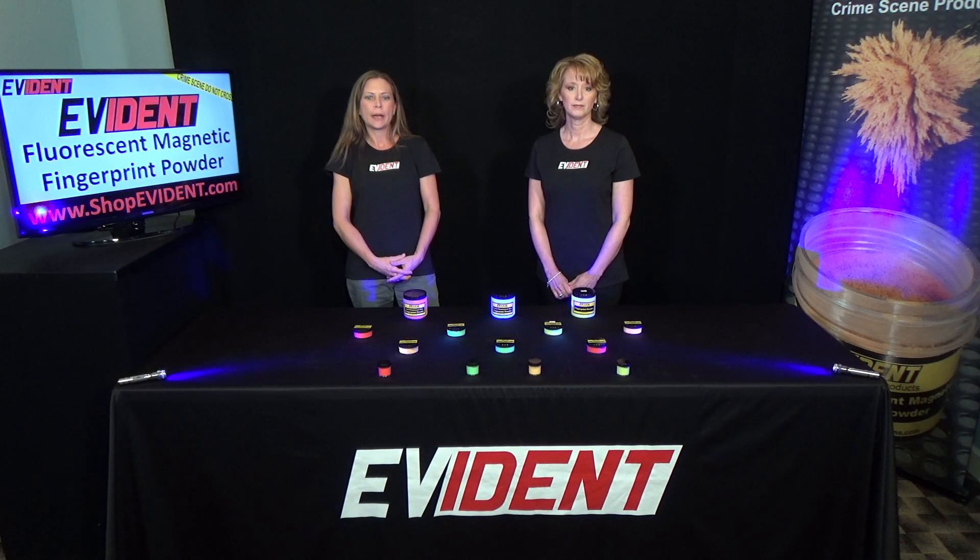Evident Fluorescent Magnetic Powders may be visualized with a forensic light source. Everything from glass to unfinished wood and paper can be developed with magnetic powder.